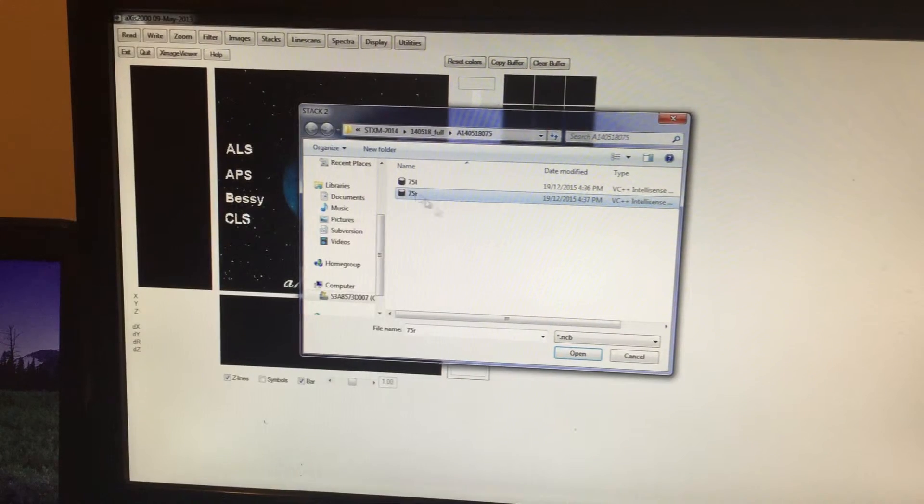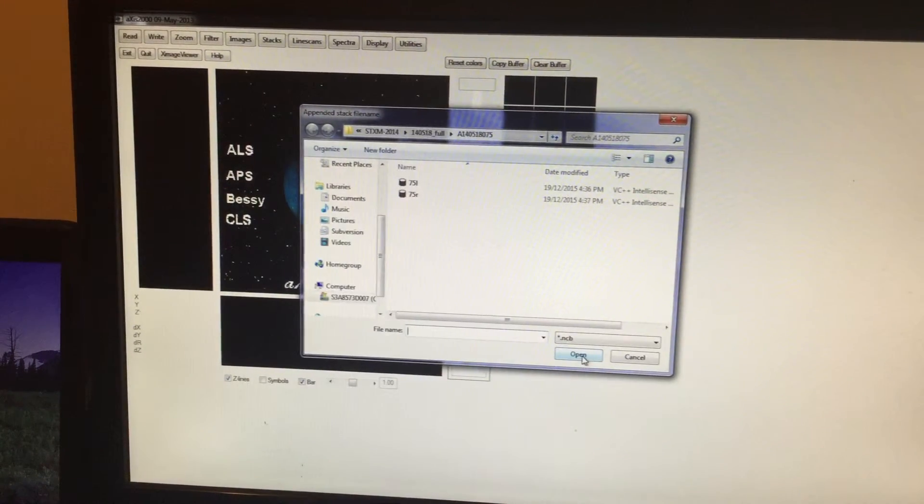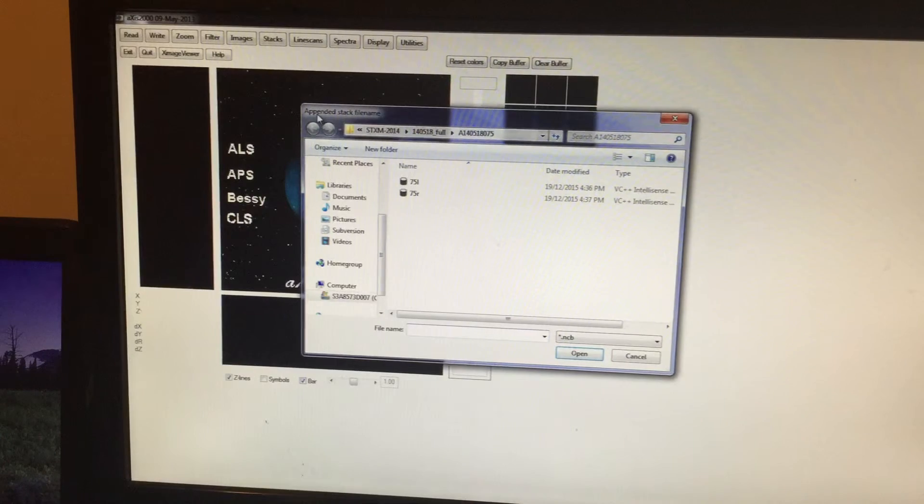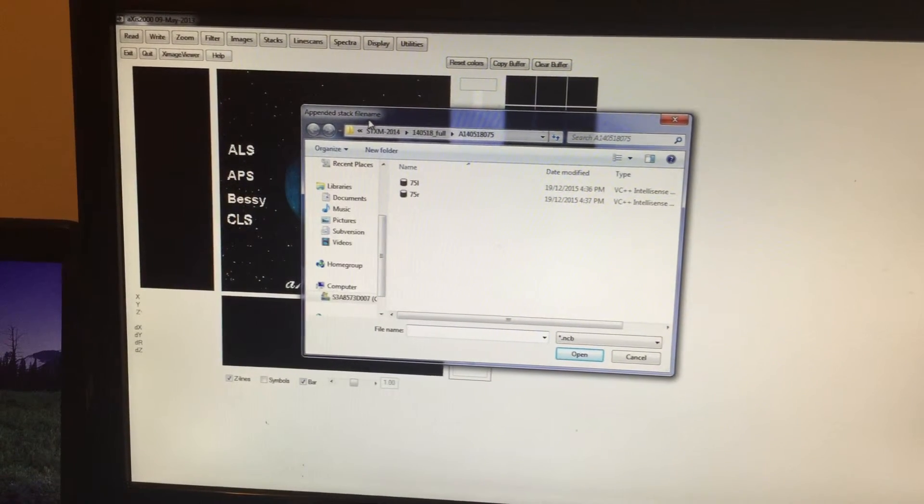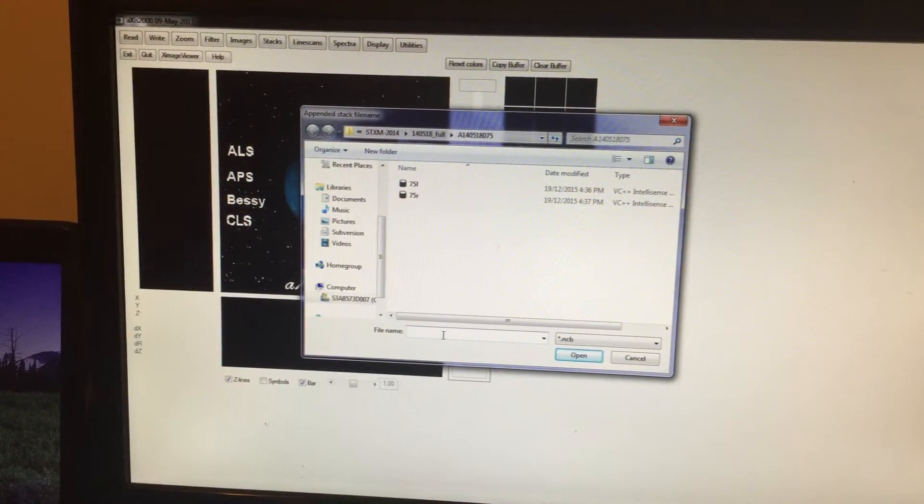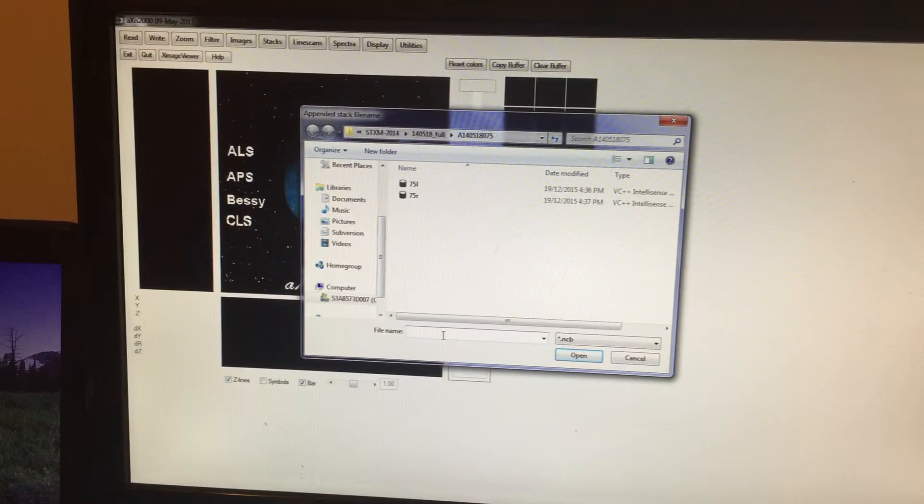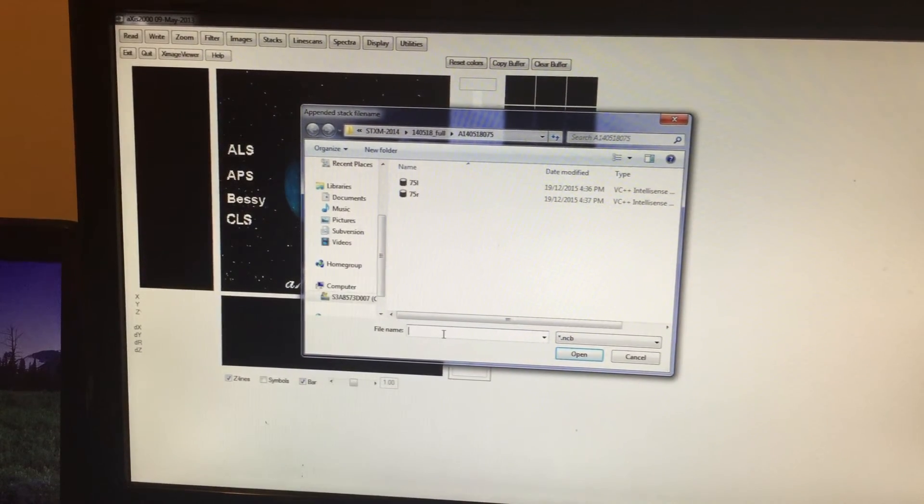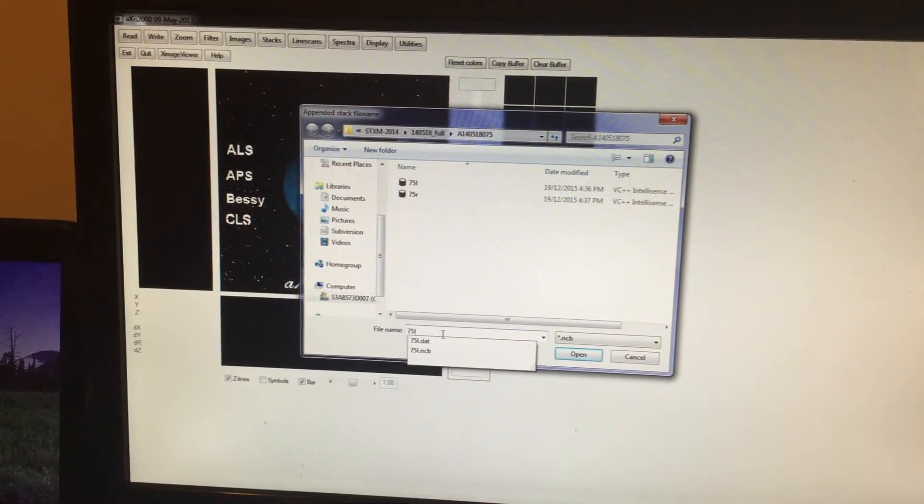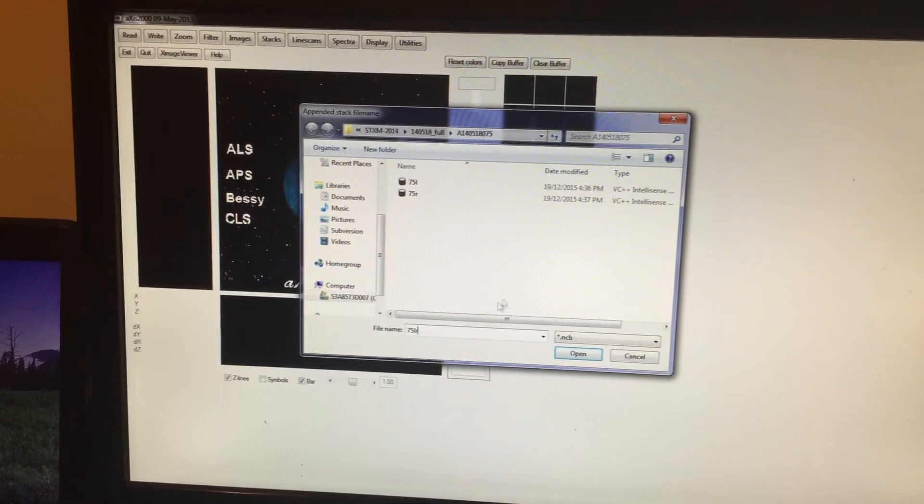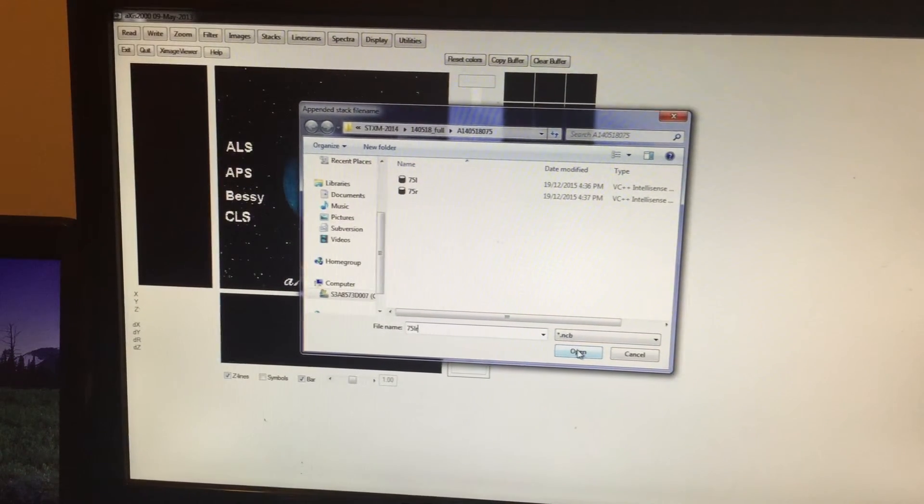Now you can see here Appended Stack File Name. So you are going to save this appended stack. I will call it 75LR, so Open, which means you are saving the data.